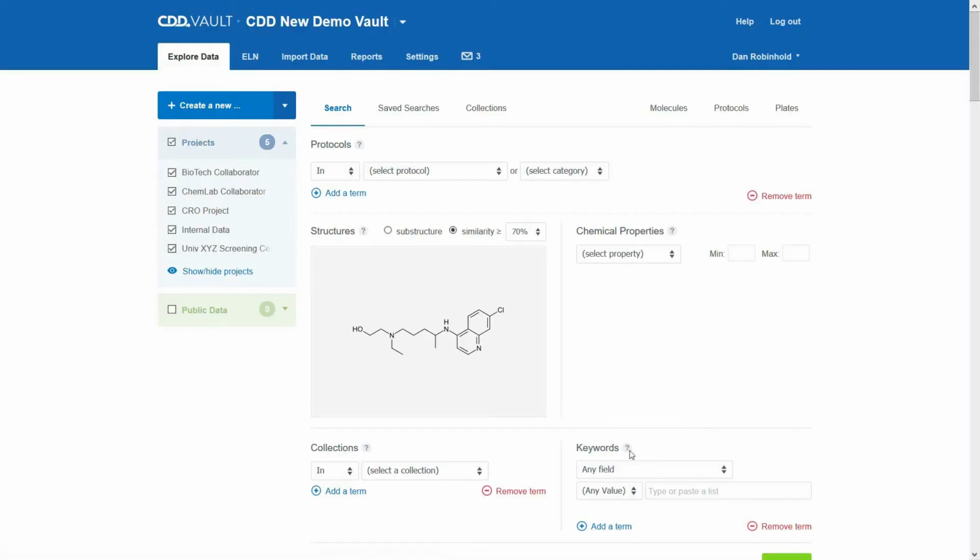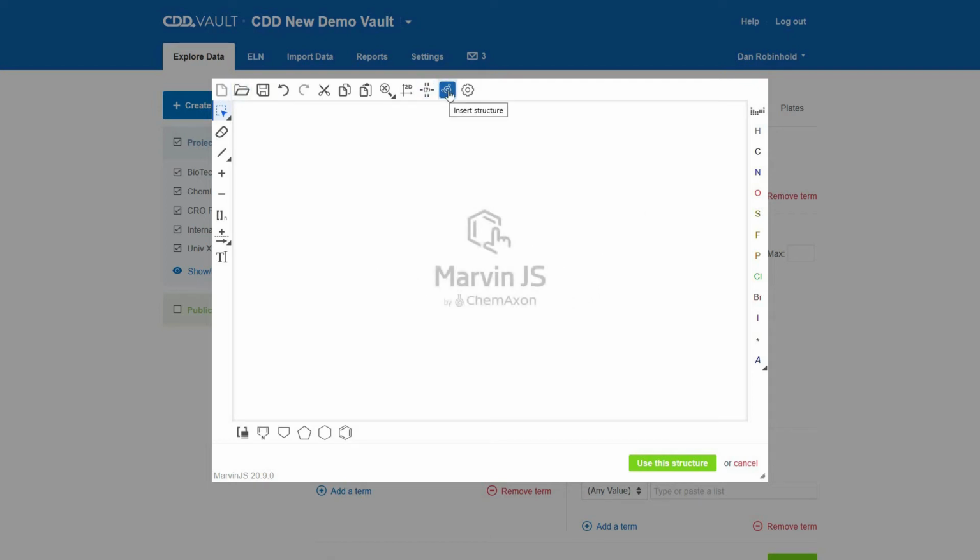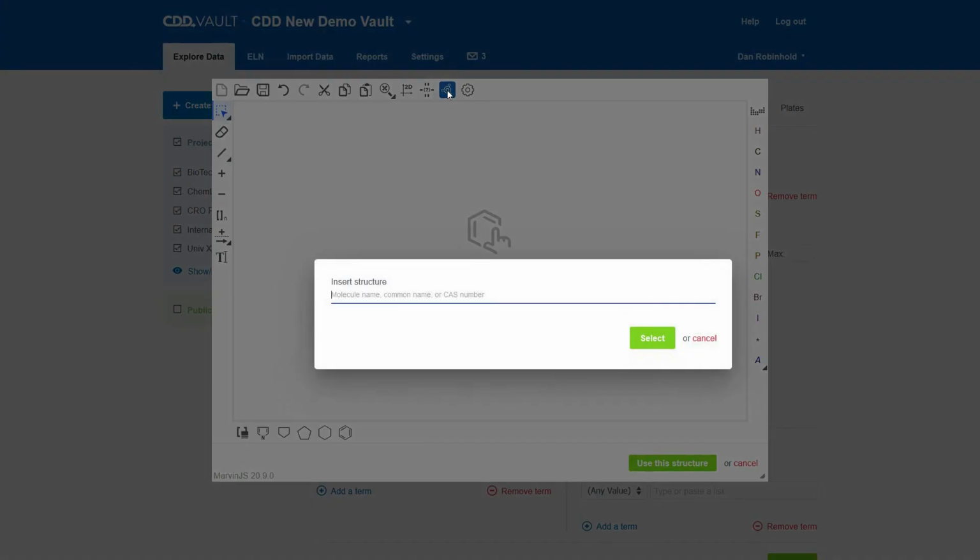You can also do a structure lookup with the magic blue button that we affectionately call this thing up here. I'm going to clear the structure here. And this is very similar to the text lookup in the import structure button, but when I use the magic blue button, it also interfaces with my CDD Vault structures.